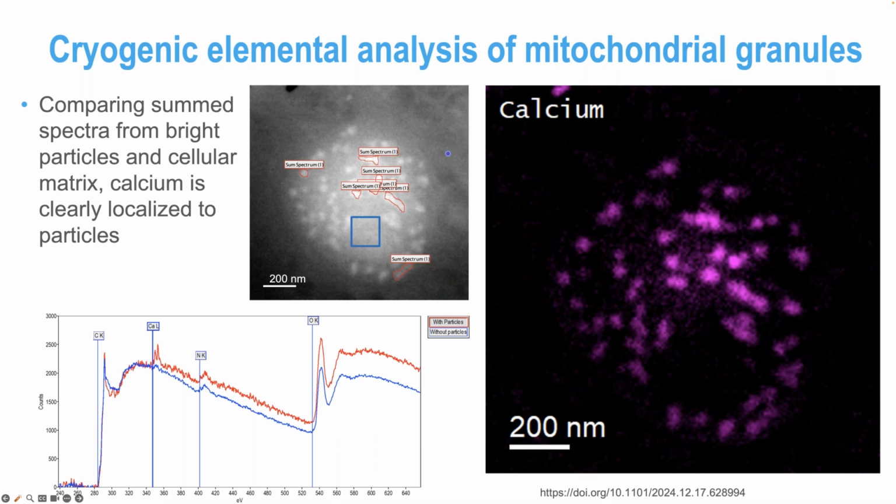Okay, that's a good question. There are two ways that can be done. In this specific example, this is just a UI-based feature in the software. You have the spectrum image open in the software, and you can draw a free path and make a closed loop around a feature. In this case, it's these little particles.